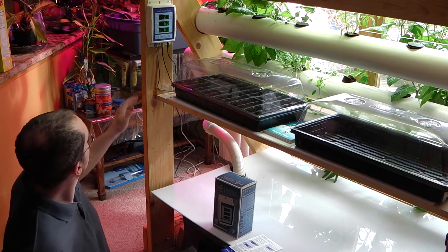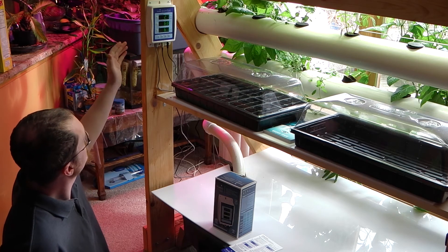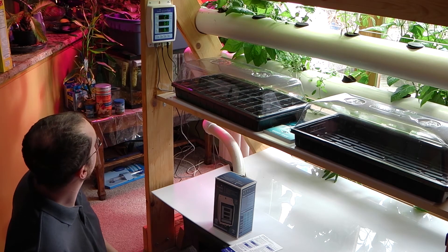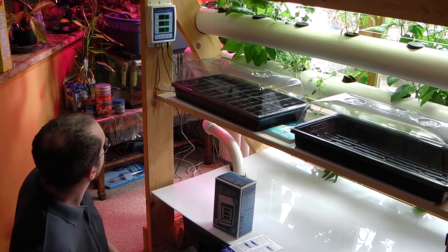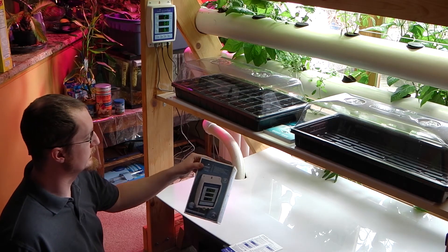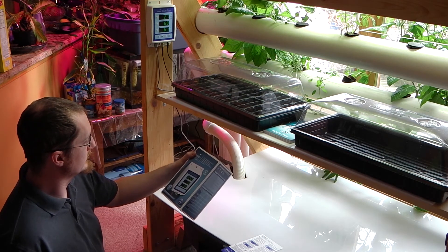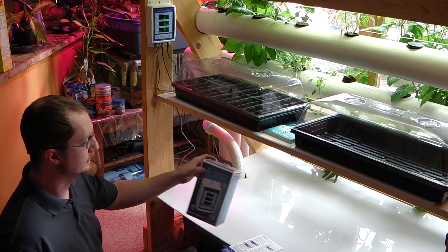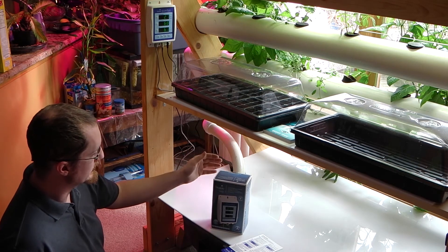They say the conductivity does not need to be calibrated, and it seems to be about right, but they do include a sachet of electrical conductivity solution that you can use to check it out.